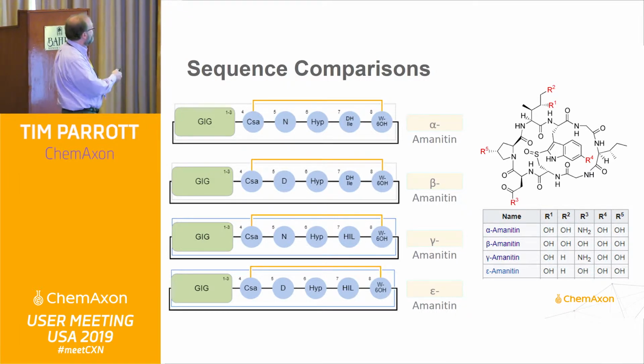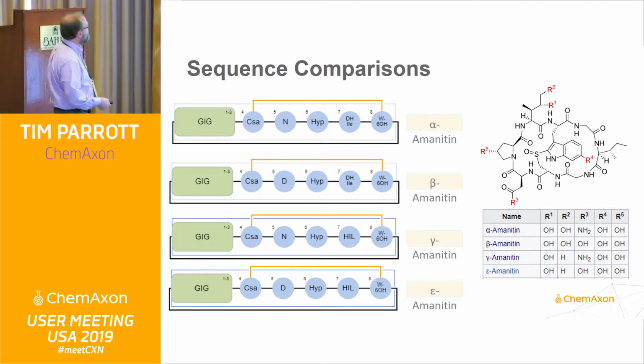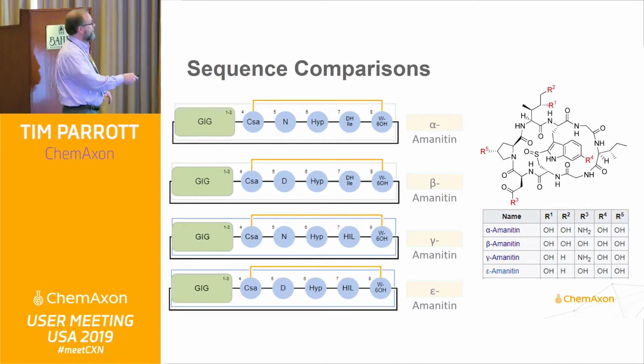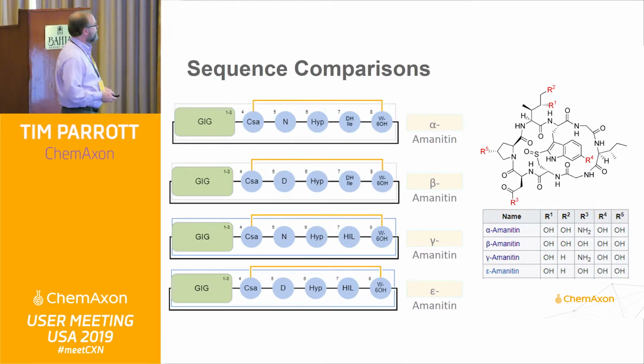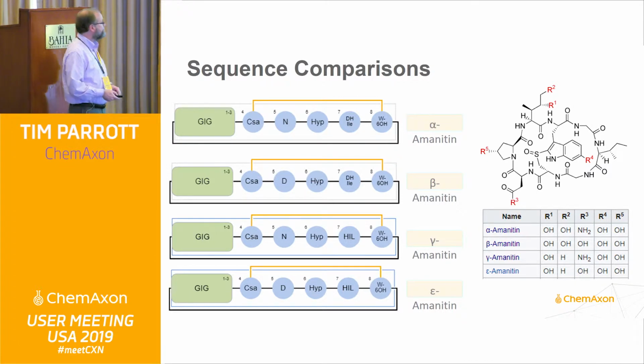And in the view over here, we have a sequence-based view. I've collapsed the not-so-interesting glycine, isoleucine, glycine side chain that's constant in all of these. And then we can just focus on the other parts of the sequences. And just doing a quick visual scan, you can see that all of the action is happening in here at amino acids 5 and 7.